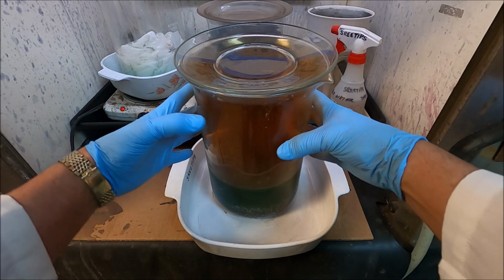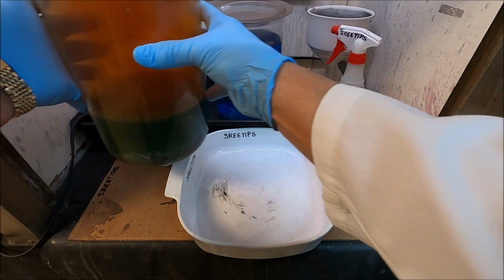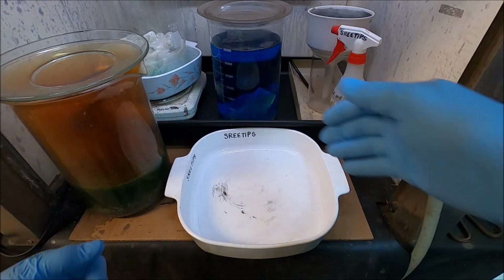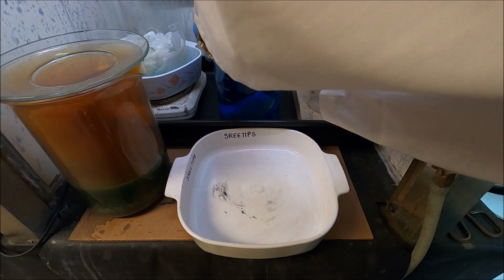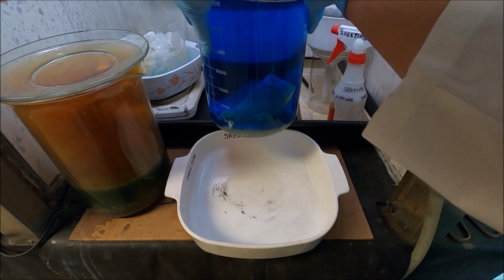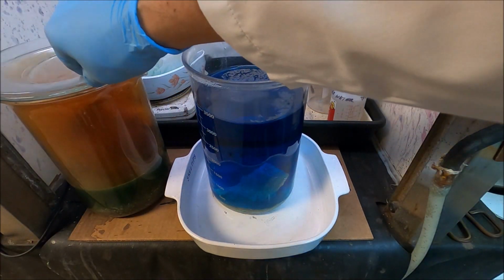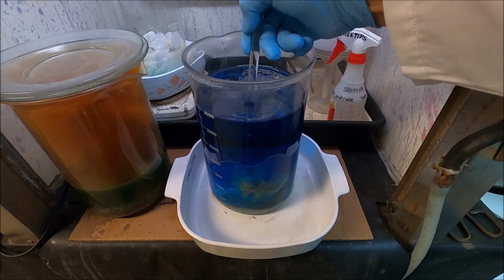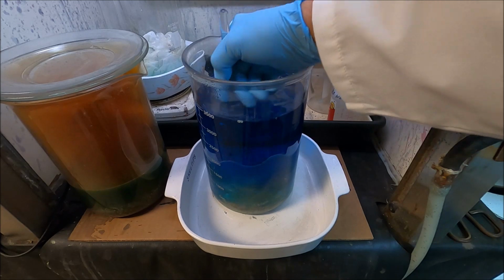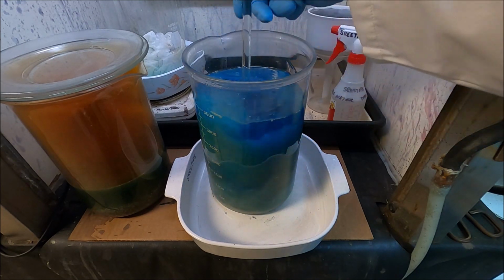Going on in here with that hot dilute nitric dissolving the silver. I'll move this over here just for a second. Pull up our silver solution back here. Take a look at this. I'm going to stick a stirring rod in there and stir this up. You see the silver's come out of the solution nicely on that copper. Copper's gone into solution.